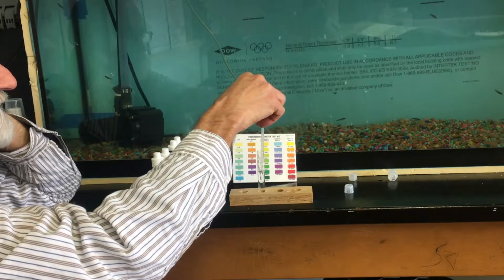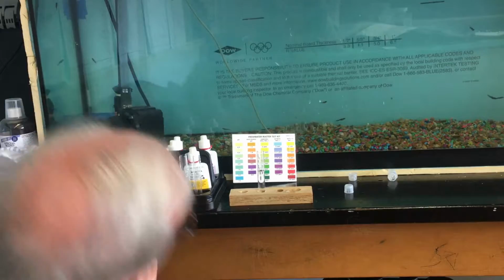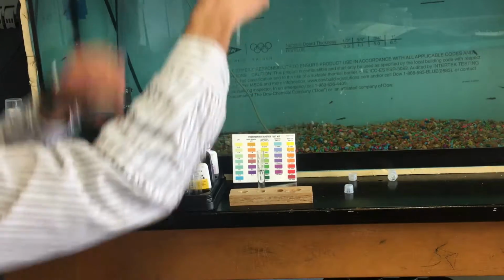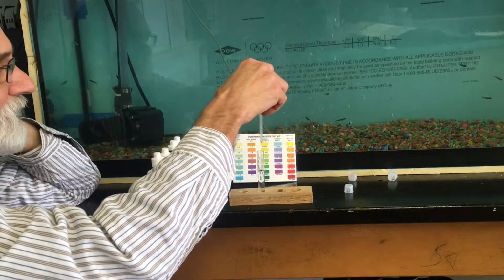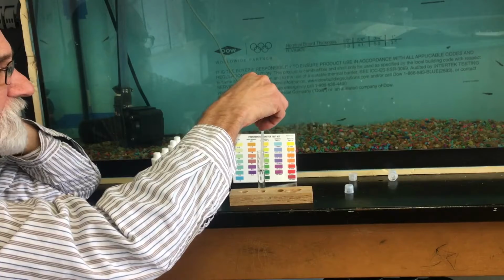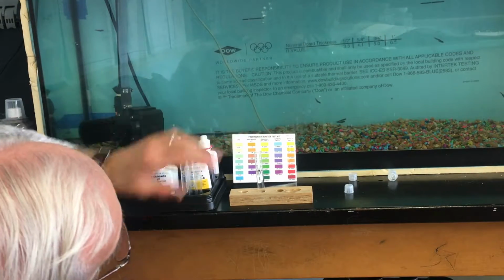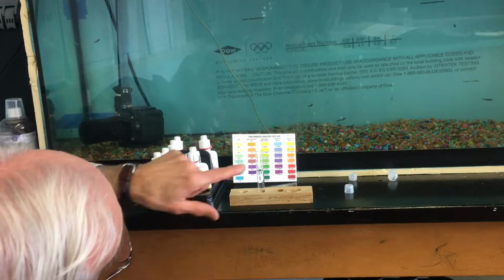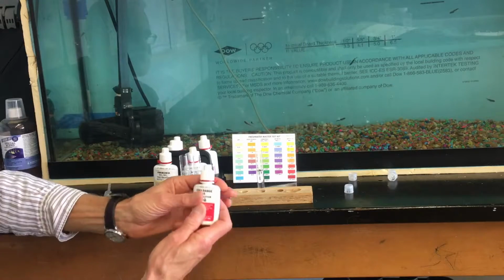So I'm filling this test tube right to the white line in the center of the test tube, and I want that little curve on the surface of the water, the bottom of that curve, to line up with the white line on the test tube. That little curve is referred to as the meniscus of the water surface, and I've got it right to that level. And then I'm going to add a test solution.